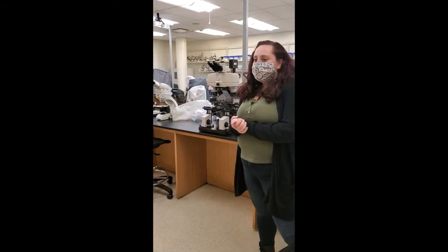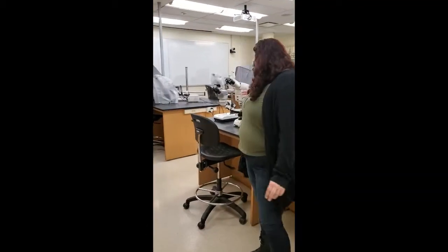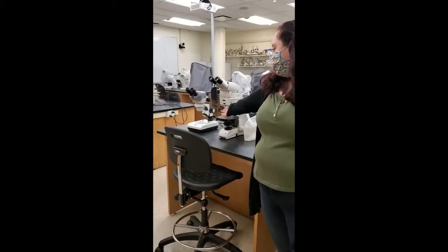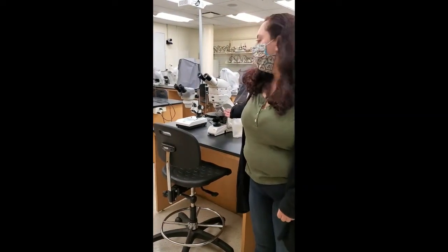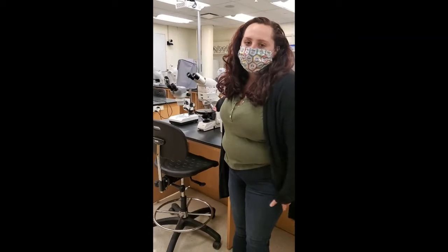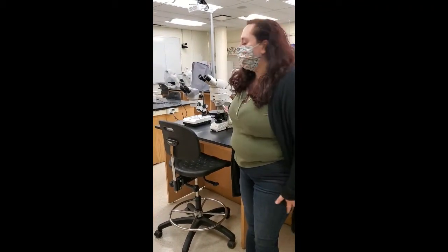In the microscopy class, where you guys learn how to use the two main ones, we have the regular compound microscope and the stereo microscope. You guys will be analyzing a whole bunch of stuff like hairs, lamp filaments, which is a common thing with car accidents and stuff. You also look at paint, polymers and whatnot.